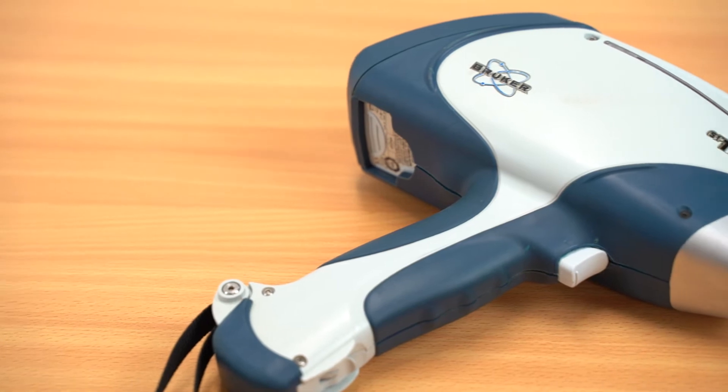Hi and welcome to Professor Spectrum. Today I'm going to demonstrate analysis on a range of samples using a portable XRF instrument.